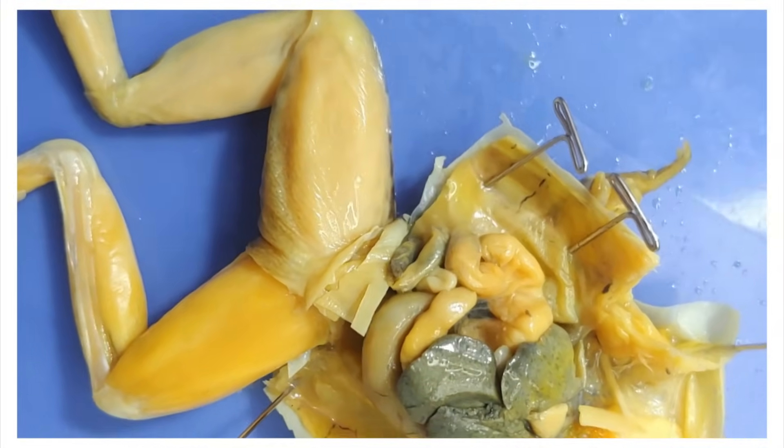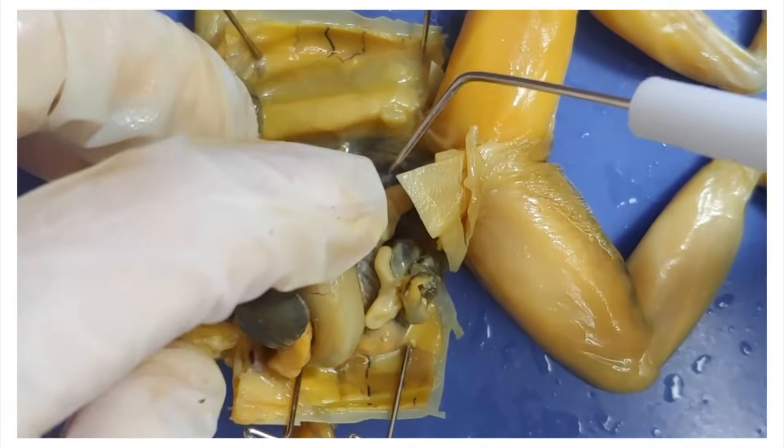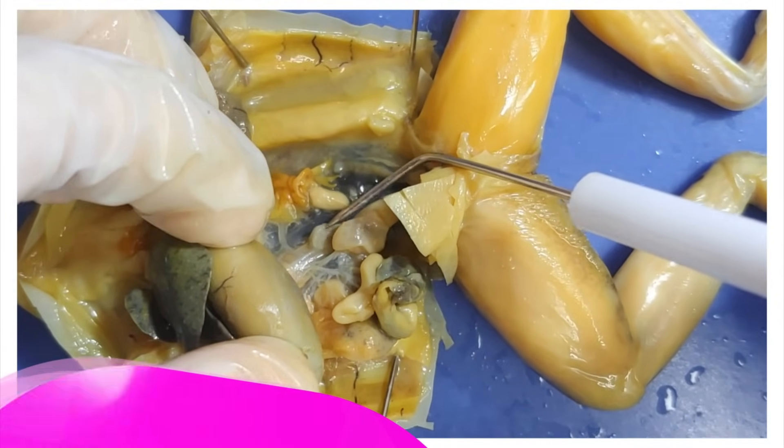I'm going to turn the tray around to get a better look at the spleen. The spleen makes and stores blood cells, and also destroys them if they step out of line.